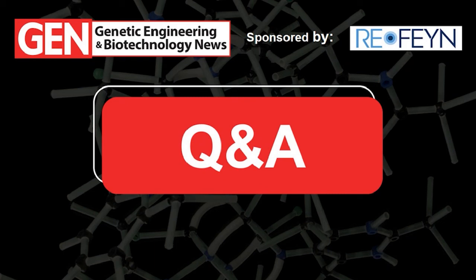All right. And next question, one of our audience members would like to know, when you say particles per mil, what do you mean by particle? Yeah, that's an important one. So when we optimized the concentration for the measurement, we accounted for every single particle. That means empty and full AAVs together. We didn't just look at one proportion. So it is the amount of physical particles in the solution, AAV particles.